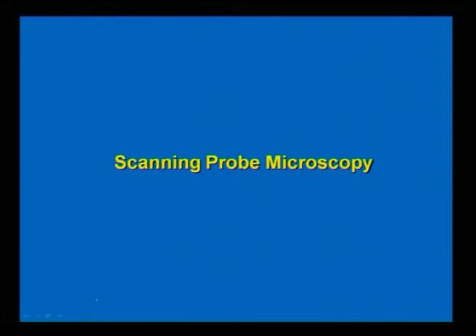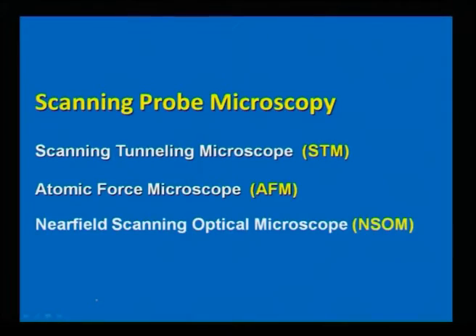So in this lecture, we are going to discuss scanning probe microscopy. These microscopic techniques were developed in the late 1980s and early 1990s, and a lot of development has taken place even after 2000. So we are going to discuss only three important methods in this connection: the scanning tunneling microscopic technique, the atomic force microscopic technique, and the near field scanning optical microscopic technique.